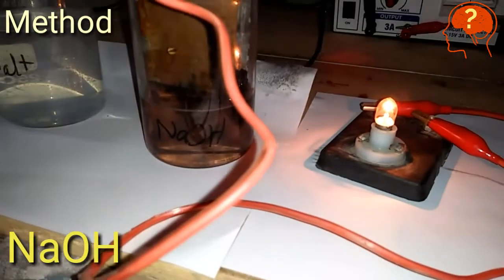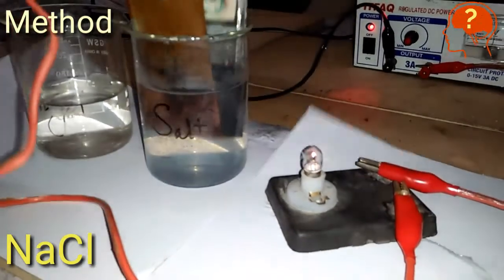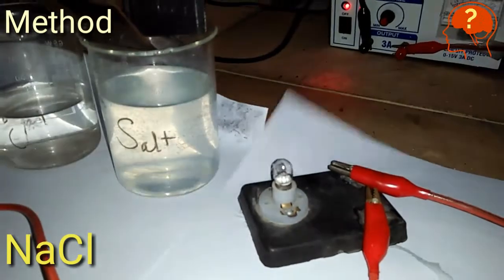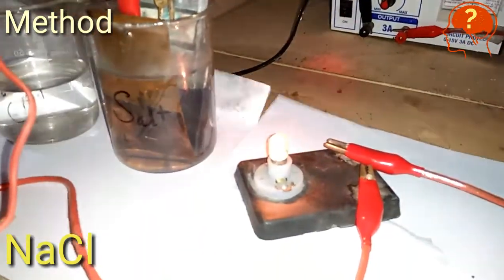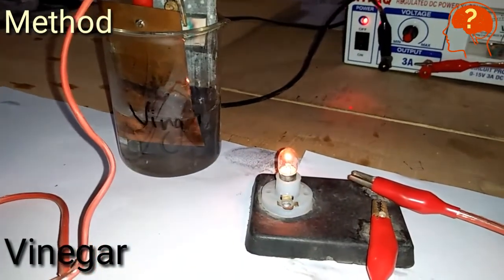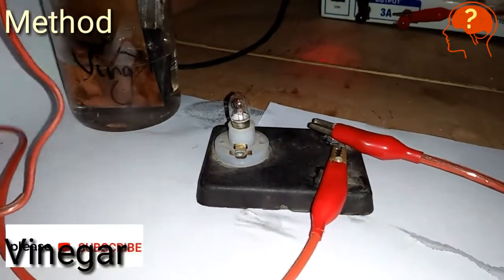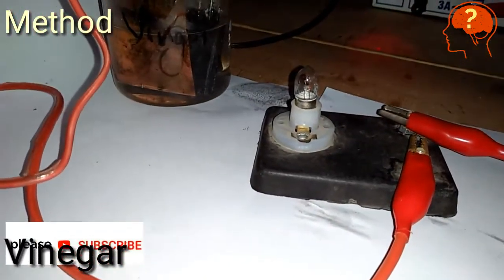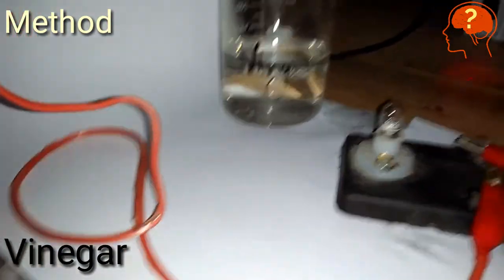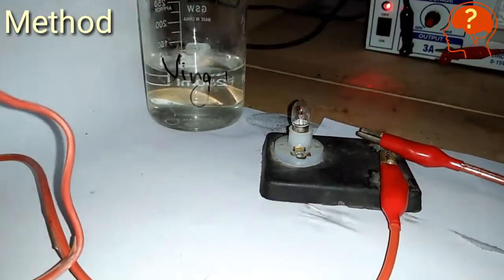Now dip in NaCl salt solution — as you can see, the bulb is again glowing, which means that salt is also a good conductor. Now finally in vinegar — you can see it's creating a dim light, which indicates that it is an electrolyte but a weak electrolyte, because there is difficulty in glowing. So vinegar is not a good conductor.